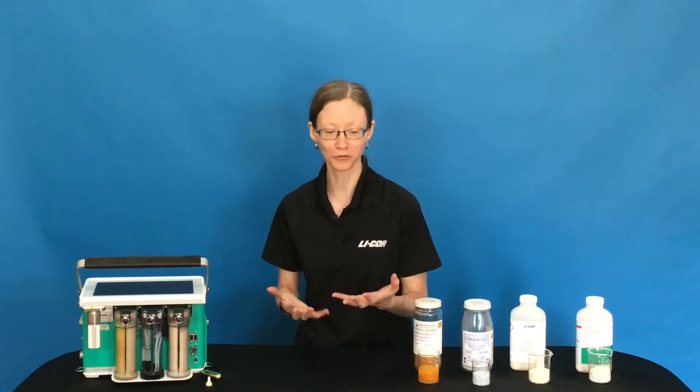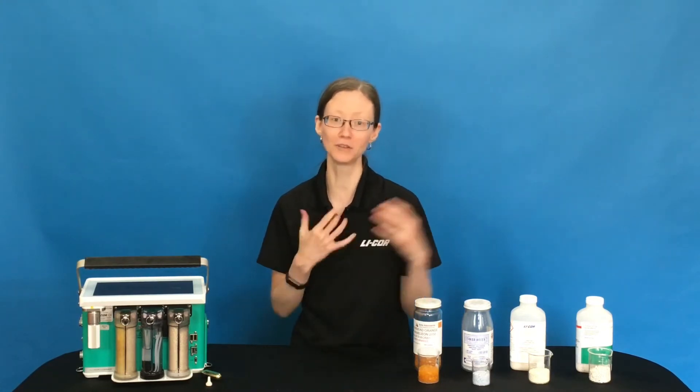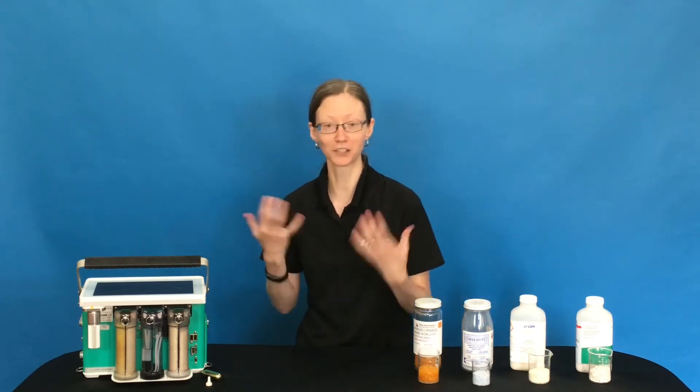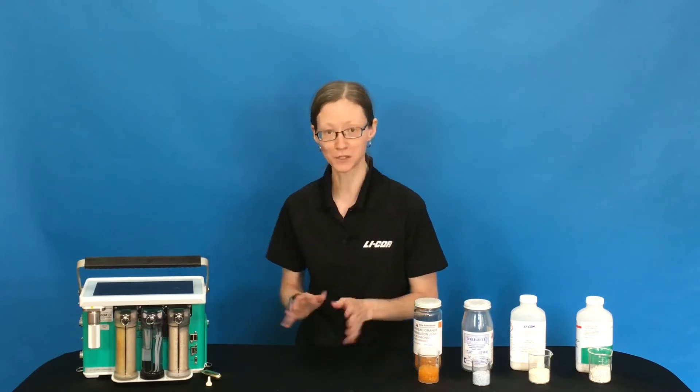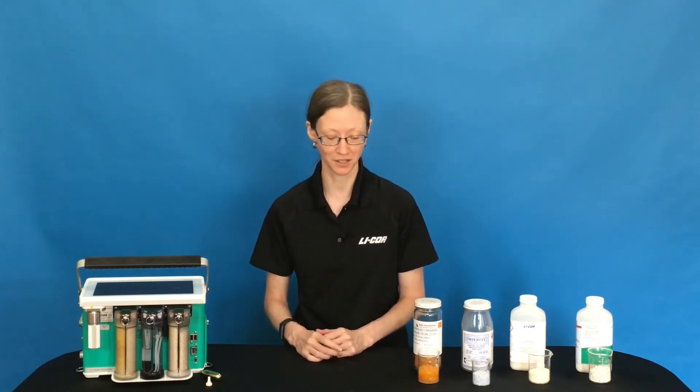You may not have all of these chemicals in your lab, but we wanted to give you an overview of all of them so that if you see them, you're not confused about what they are and what to do with them. I'm going to start with how we remove water, and we have two different chemicals that remove water that you might see used with your LI-6800.